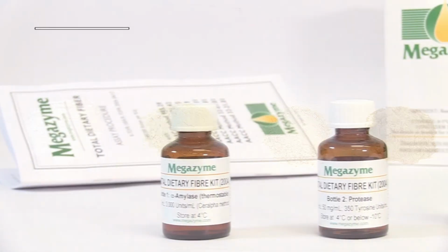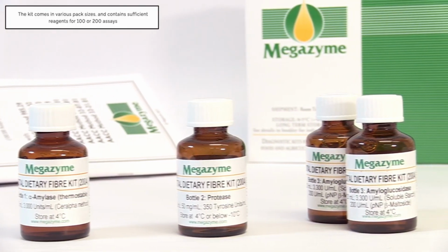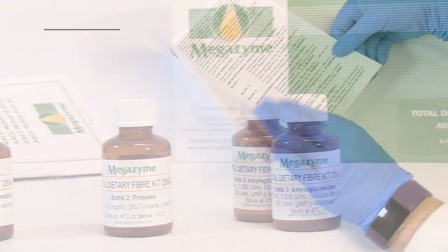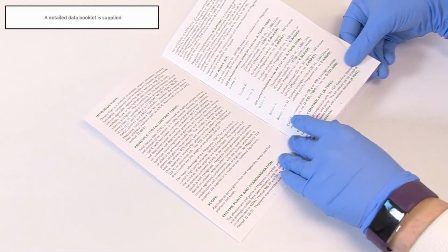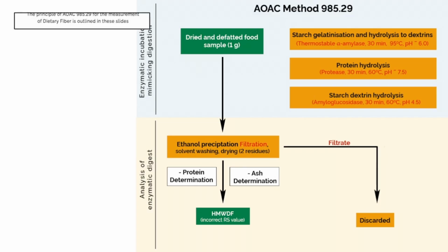This video tutorial will demonstrate the use of this method with various sample types, along with assay blanks. The kit comes in various sizes, containing sufficient reagents for 100 or 200 assays, and is supplied with a detailed data booklet. The principle of the Prosky method for the measurement of dietary fiber is outlined in this figure.